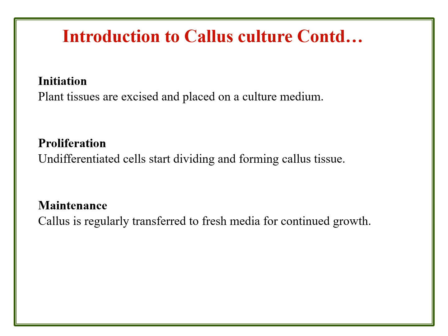Then the third phase, that is callus culture maintenance. Every time here the pH and ionic strength are very important factors, and temperature also. Temperature fluctuations always create more problems for callus establishment in plant tissue culture. So regular monitoring is required after 30 to 45 days during proliferation. Callus must be regularly monitored.